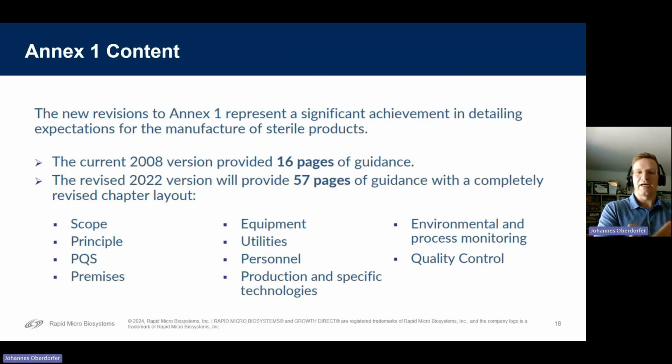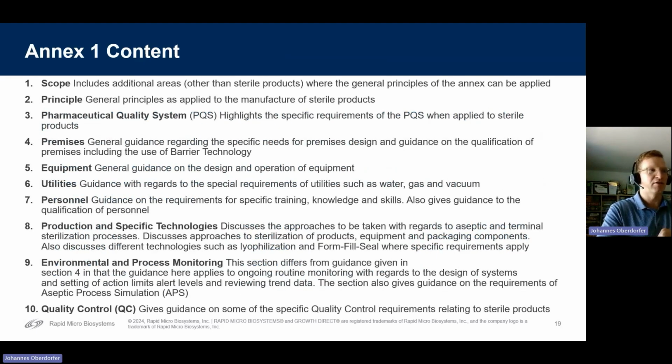With guidance also on specific topics, it's now nicely structured into these 10 topics, which are scope, principle, PQS, premises, equipment, utilities, personnel, production, specific technologies, environmental and process monitoring, and quality control. And not to forget the glossary at the end.